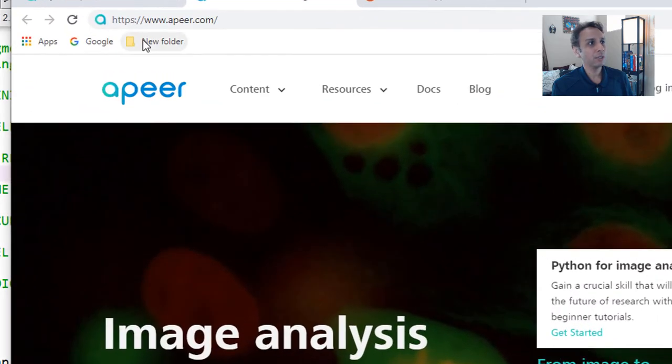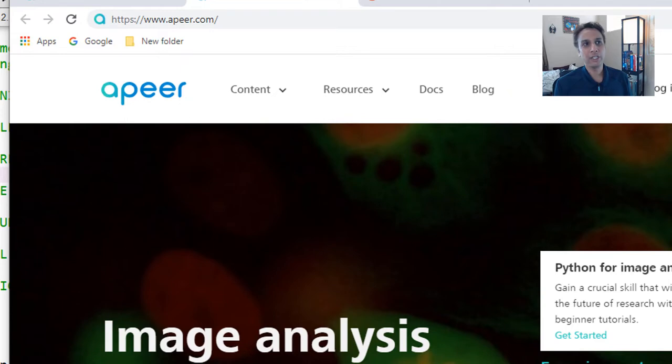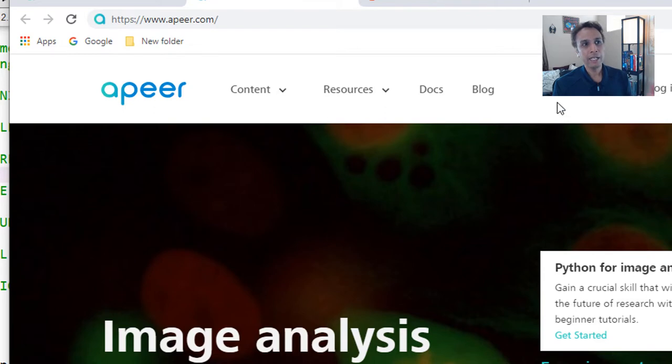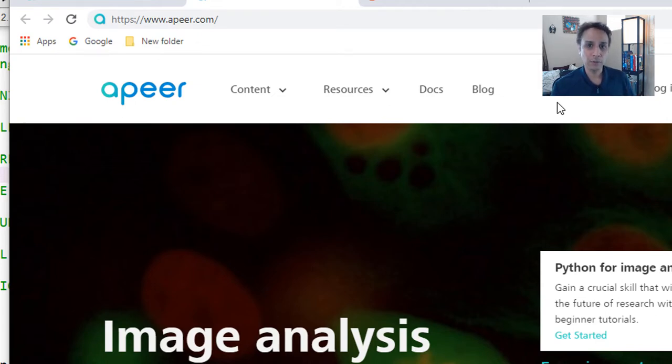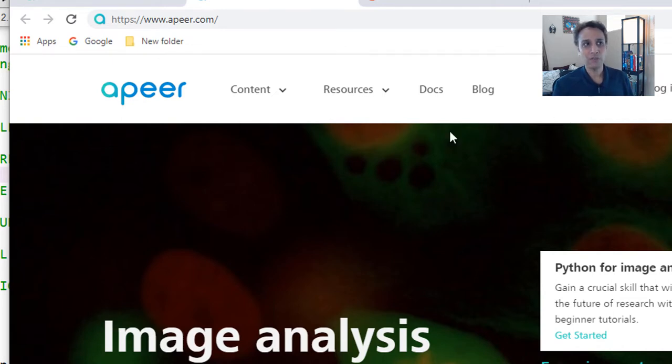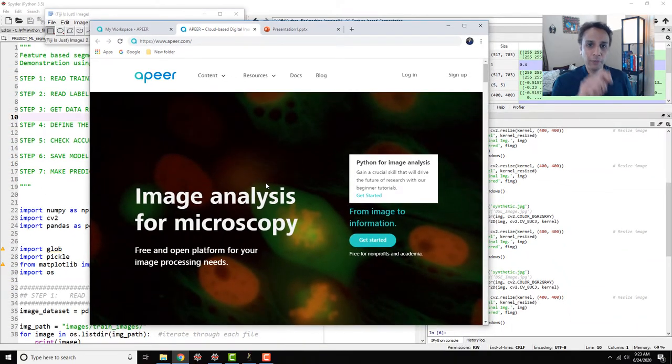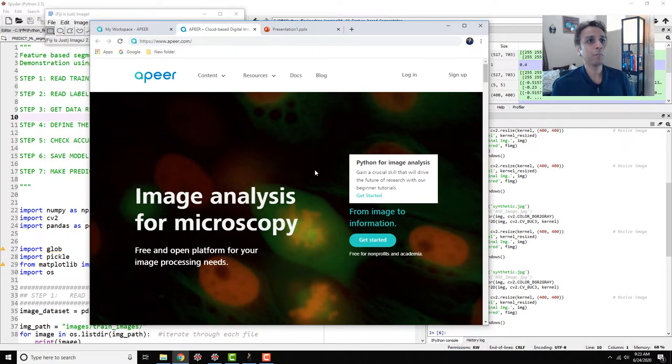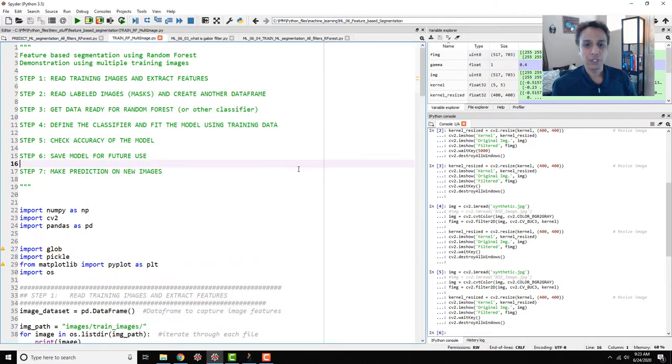If I bring a different image, you probably see. So I started off by just painting a few pixels and then saving the masks like this and running a machine learning algorithm like the one I'm about to show you and then generated a whole bunch of segmented images. Now after verifying that they're good, I can use these as my masks for other tasks. How did I paint these few pixels? Please go to www.apeer.com, A-P-E-E-R.com. This is an initiative. This is what I do at work. So this is an initiative by Zeiss. And by sometime around July 2020 timeframe, the tool is probably already here. Just wait a couple of weeks for that annotation tool to be made available as part of Apeer. It's a great tool where you just paint the pixels, save the masks.